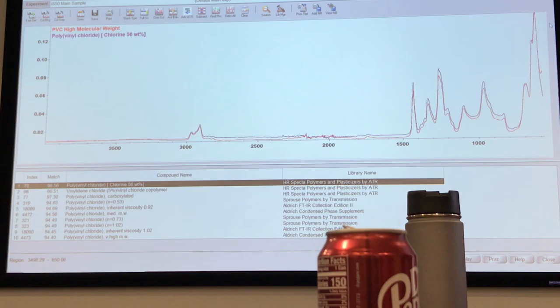Will a reflectance spectrum work for this? A reflectance spectrum would be very difficult, though there is one very nice report from a lab on differentiating these two, and we have tried it as well. Both transmission and ATR can be used, but reflectance, no. Can direct reflectance differentiate between rayon and regular cellulose? Almost impossible. You can measure for hours and get a very good quality spectrum, but the peak will be pretty flattened out in that region. Those are the real challenges that are going to come. In that case you definitely want to squish it and get good data.